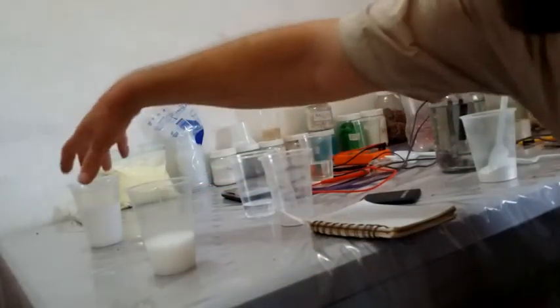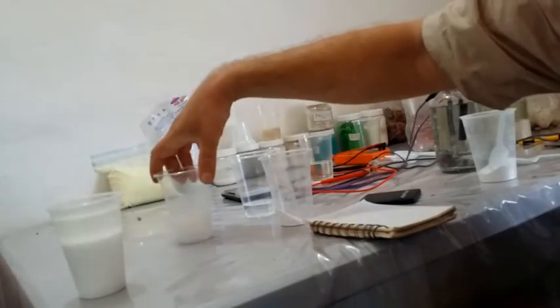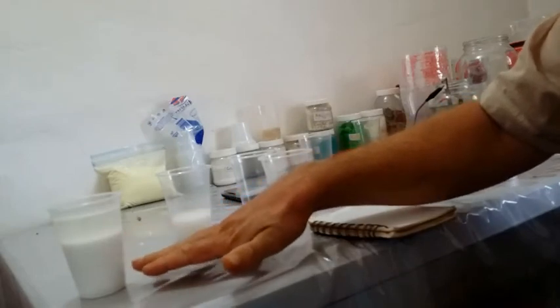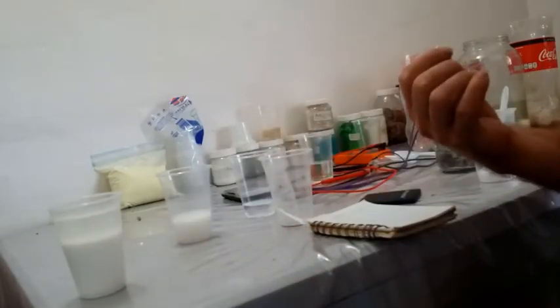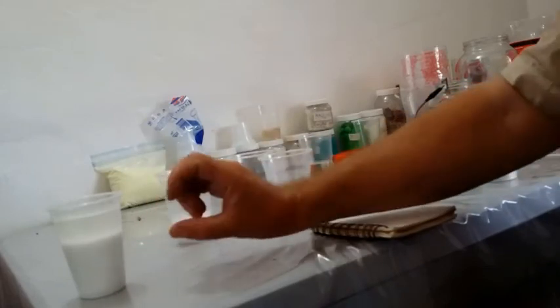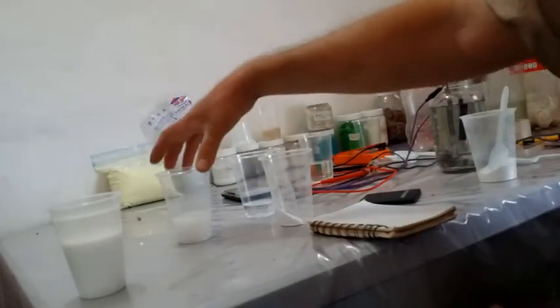I've got one here finished. What you'll end up with is a sediment of your zinc carbonate, and the water will be filled with sodium sulfate. You can dry out the sodium sulfate and keep that for later. Then just decant that off, keep your zinc carbonate, wash it out, filter it a couple times, and use it for what you want.